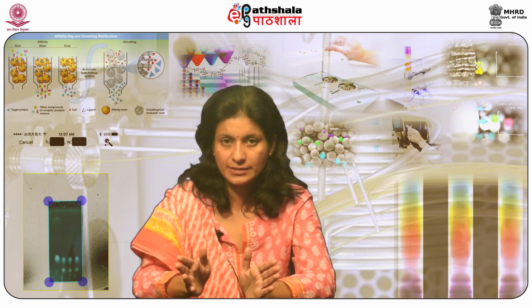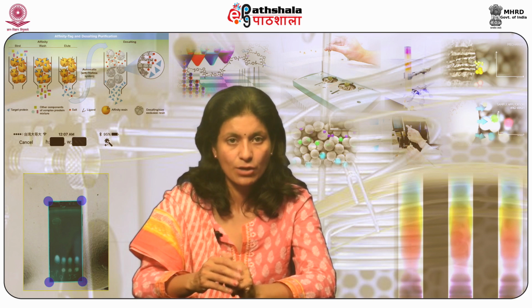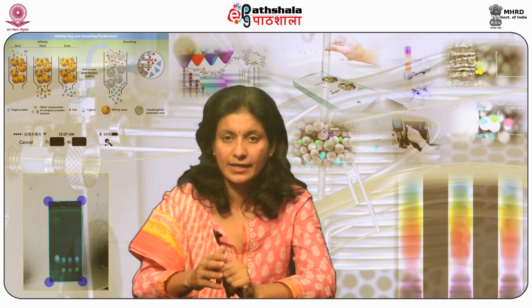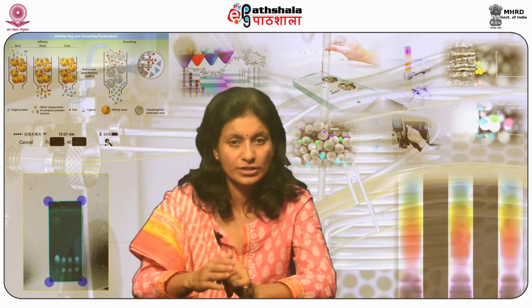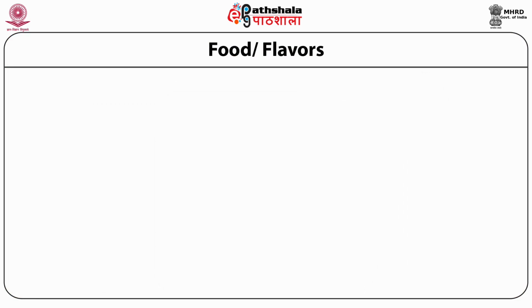IEC is broadly accepted as the specialized reference method not only for wastewater analysis or for water but has the potentiality to meet the requisite of the standards. It is nowadays increasingly recognizable in the laboratories of industries, like evaluation of heavy metals and cyanide polyphosphates in electrochemical and tannery waste, chemical purity and heavy metal analysis in fertilizers, analysis of alkaline earth metals, sulfur and chlorine in paper industry. Food flavors.